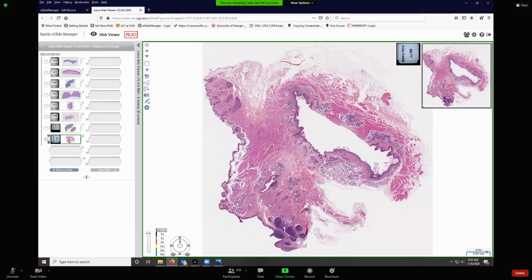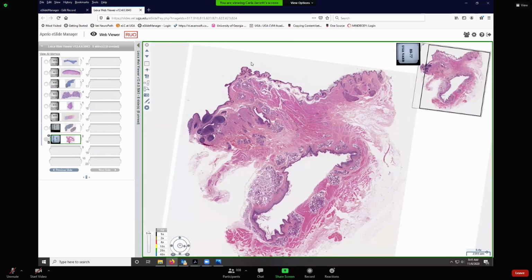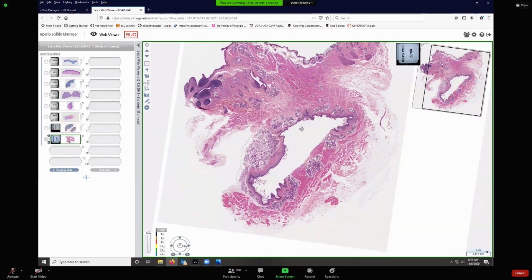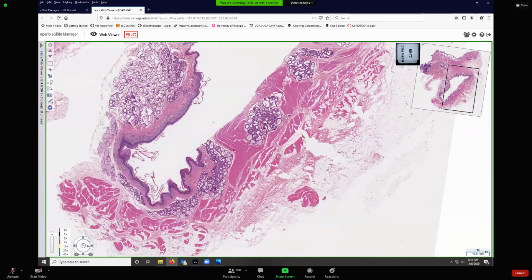This is the anal sac slide. So let's turn it here. This is just regular haired skin surface. There's a little bit of the rectum right here, and this is the anal sac right here. So here's its duct. Those invaginate, and if you haven't seen them in gross anatomy yet, you need to. At the 4 o'clock and 8 o'clock positions, you'll see those ducts. Stick a probe in there and make a cut with your scalpel, and voila, you'll be down in that anal sac, which will be filled with all kinds of lovely funk for you to find.